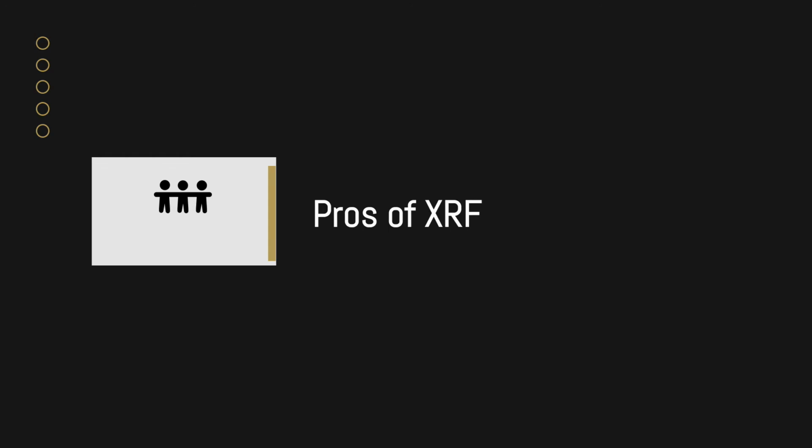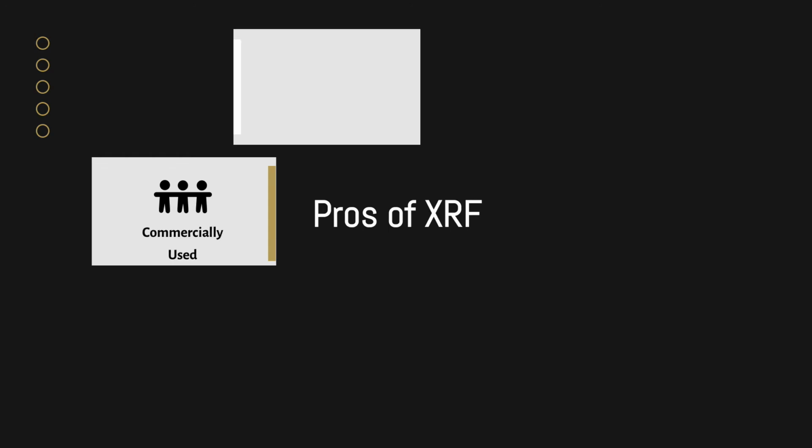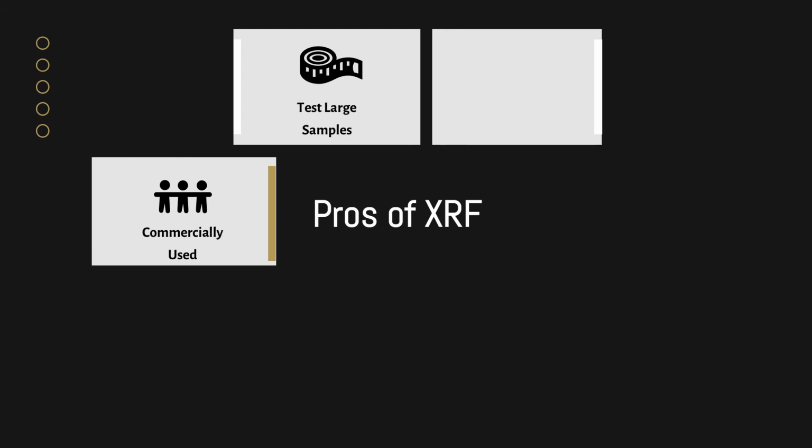Pros of XRF. Emission of fluorescence in samples provides a powerful tool for analyzing, which is now utilized by commercial instruments. XRF is well suited for large samples larger than 1 gram. It can be used to test a various range of elements from sodium to uranium. It can test solid, liquid, and powdered forms of samples.